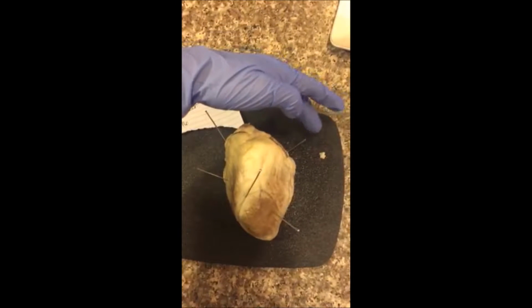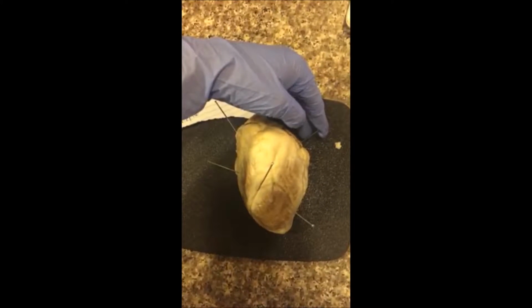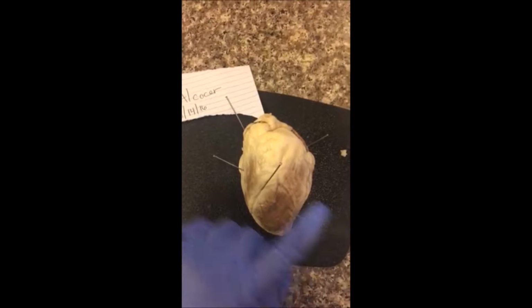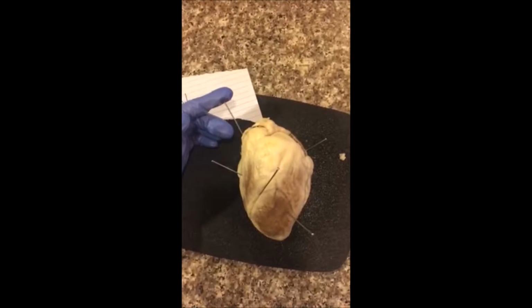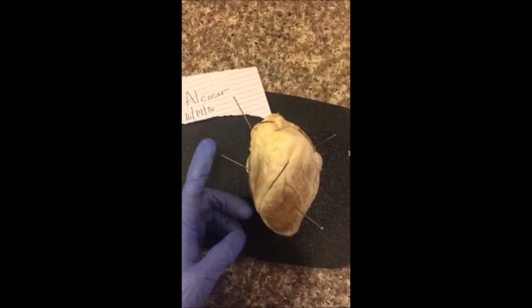The left auricle is located here and it collects oxygenated blood from the lungs before transferring it into the left ventricle located down here. The right auricle is located here and it collects deoxygenated blood from the bloodstream and transfers it to the right ventricle, which is located here.